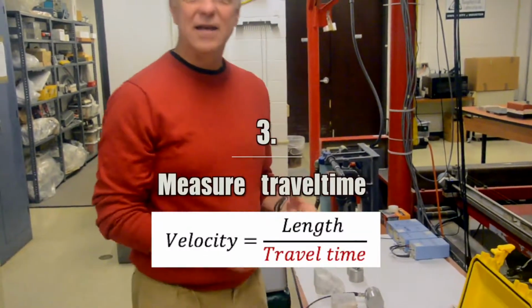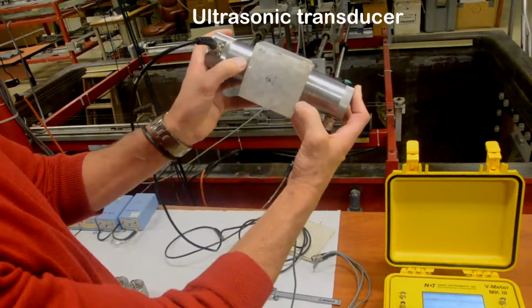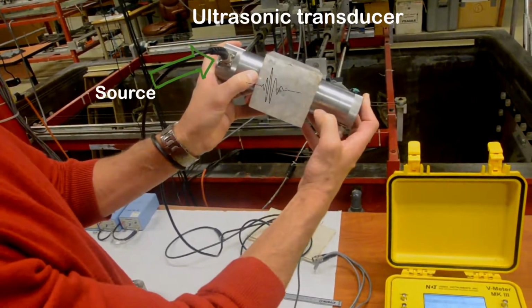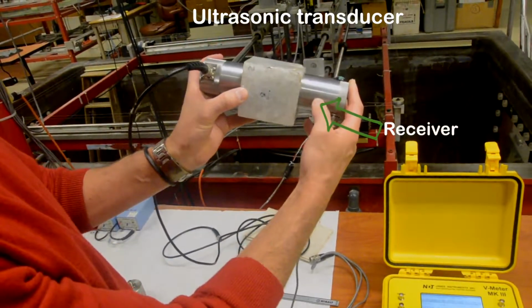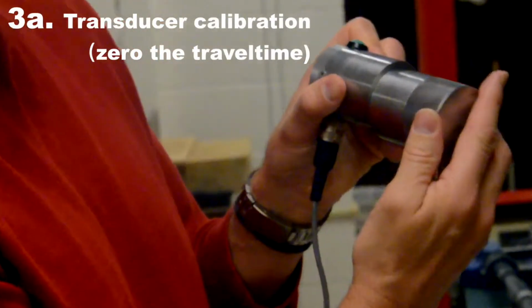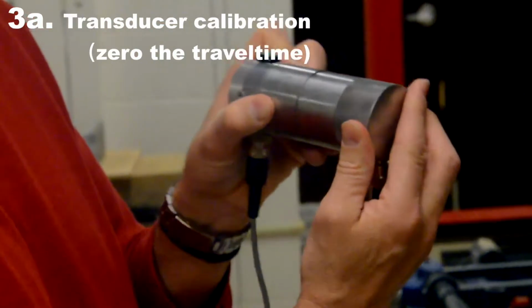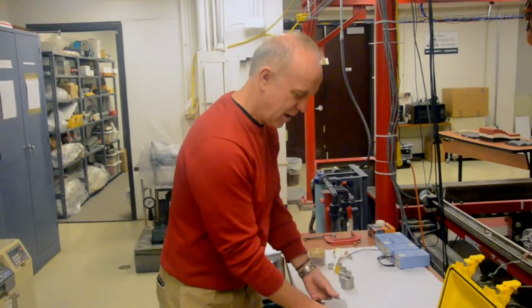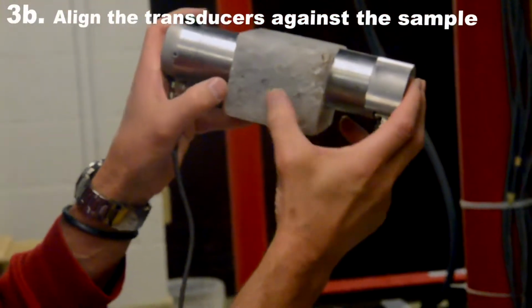Then we have to get the travel time or the time of flight. We're going to use an ultrasonic transducer on one side that creates a little pressure vibration that goes through the salt and is received at the receiver. Just make sure that when face-to-face, the transducers are at a 0 time, and we'll calibrate those, so that's 0.